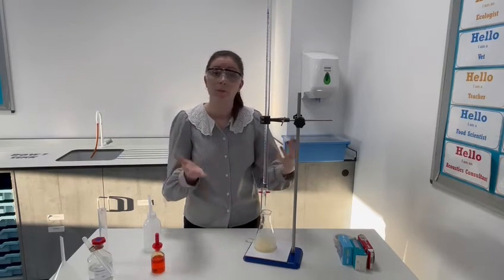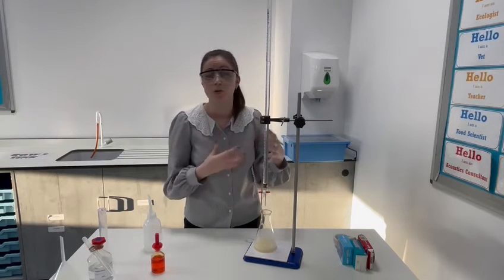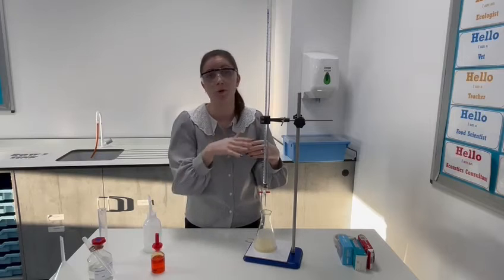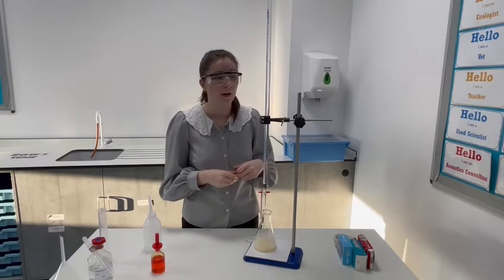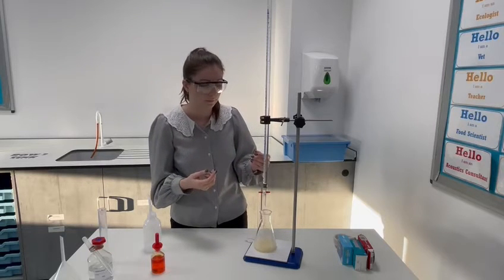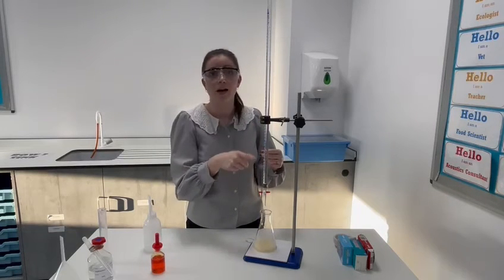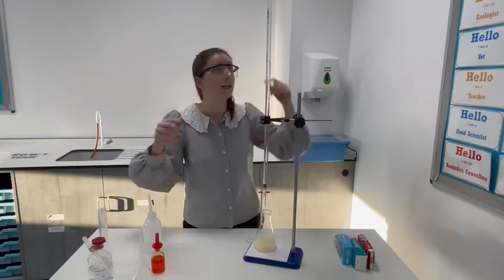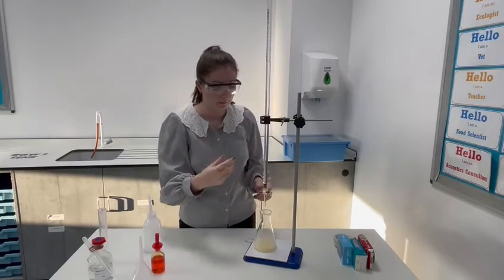It could be a good idea before the practical to just do a trial run with your acid, just to make sure that the concentration is appropriate for the sort of readings we want students to get. However, that could be part of the investigation for students. So once we have our acid in our burette, students will add using a funnel, and ensure that they take the funnel out because that can impact their reading.